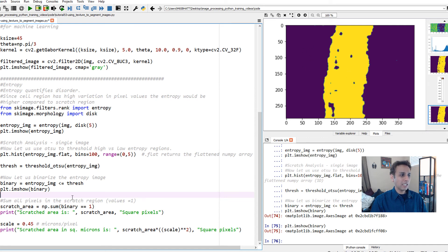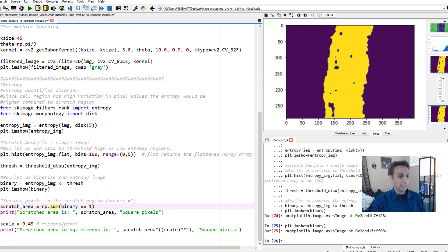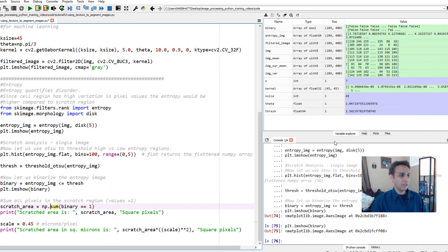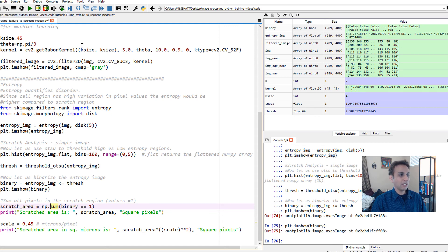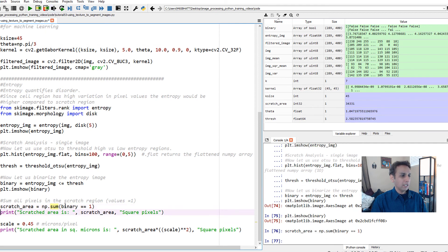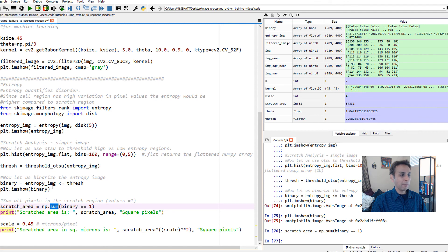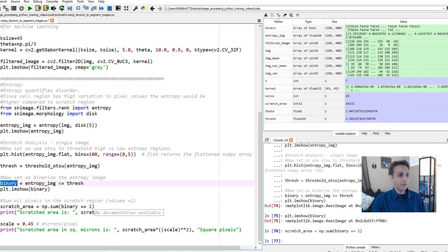This area is very nicely separated from the cellular region. Once it's separated, my scratch area is - I'm converting this into a NumPy area. Let me go back so you understand. My binary right now is boolean false or true because we applied a threshold.